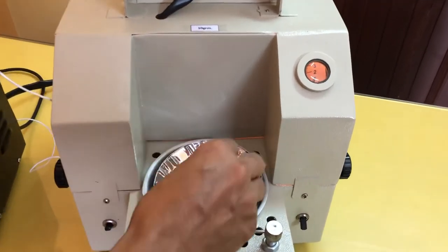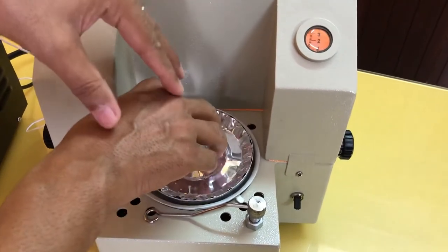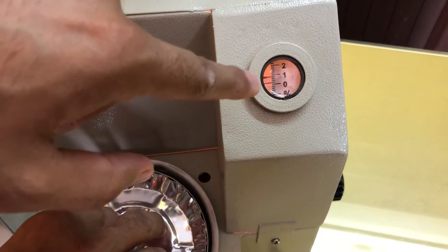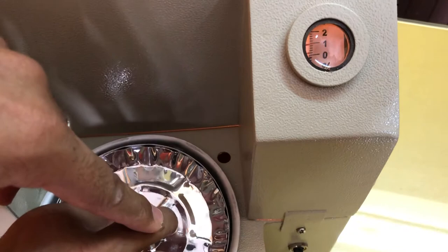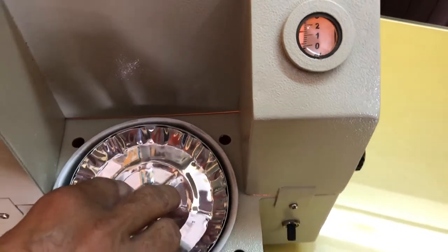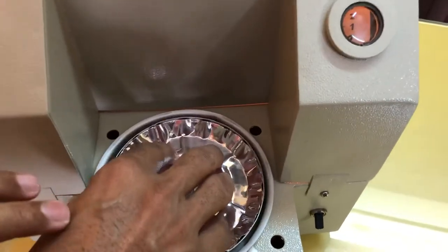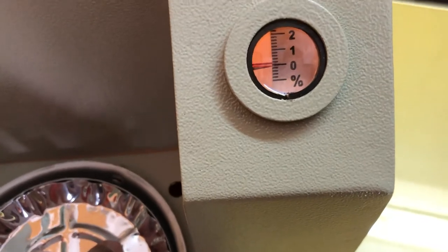We have to place sample on this sample pan so that, as I give weight on the sample pan, that pointer will come down. We have to add that much sample so that this pointer coincides with the reference line. And if you place more sample and the pointer goes below the reference line, you can take out the excess sample. We have to place only this much sample so that this pointer coincides with the reference line.